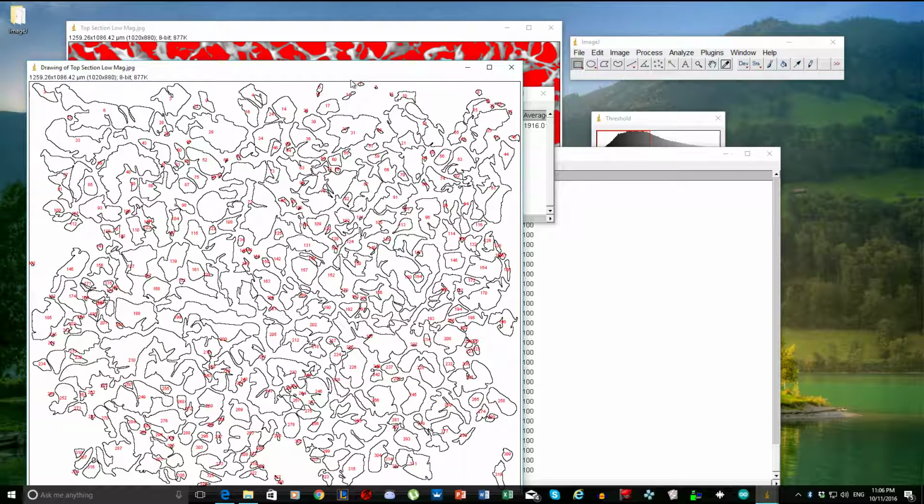I was playing around with it too, and I tested it, and the 20 and 0.01 values were the best that showed results, and still kept these little pores and did not get rid of them. I think that's the best for me. You can play with it too. You can set it up in a different way. You can use my setup. You are free to do whatever you want.